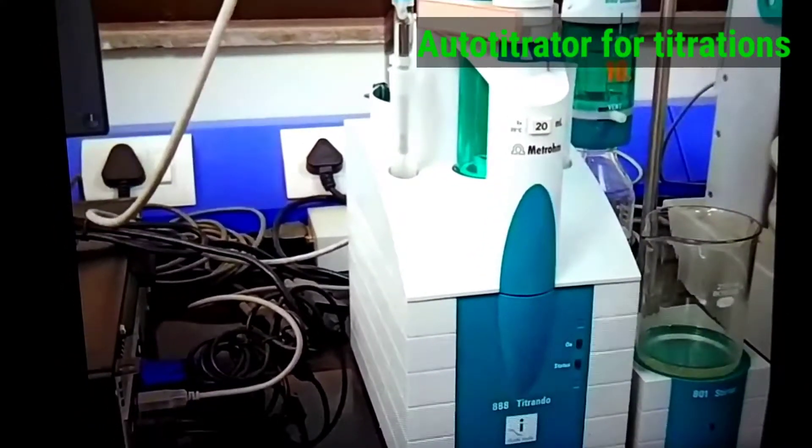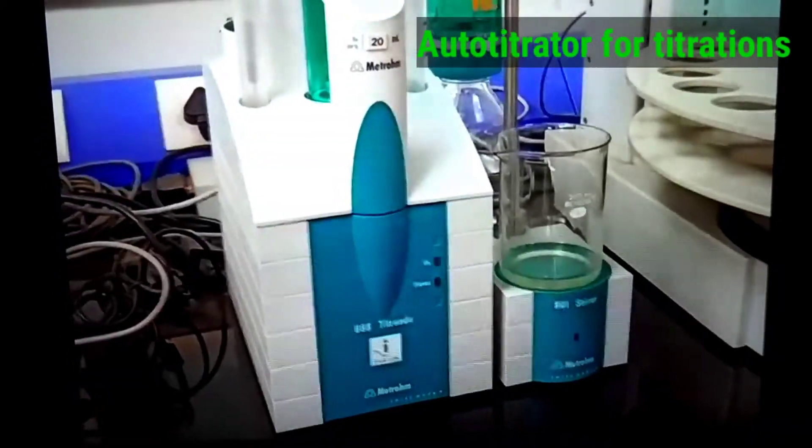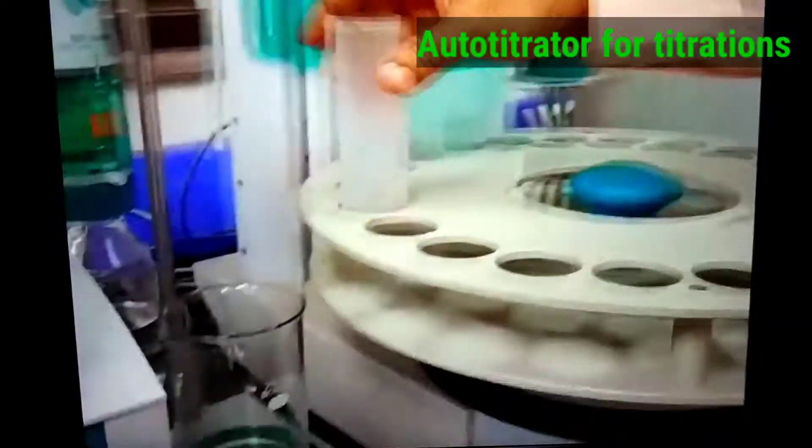So you are taking this sulfuric acid for doing the titration. So in this bottle, in this brown bottle we have acid, 0.02 normality. Then we are putting the sample in a tube here like this.